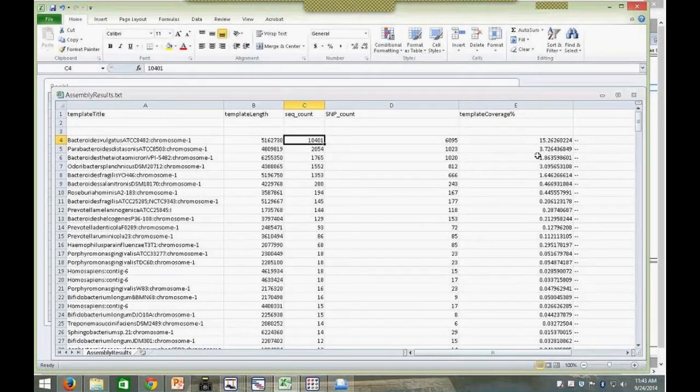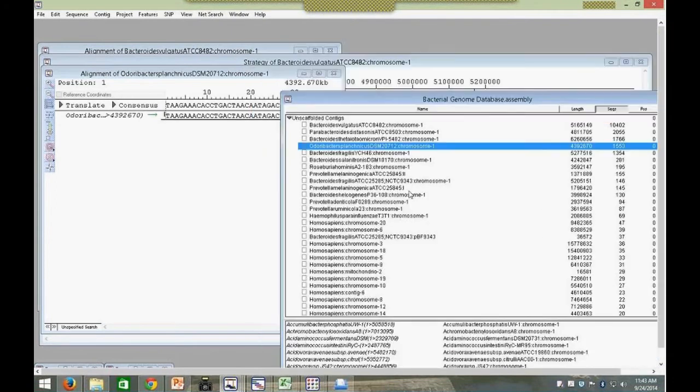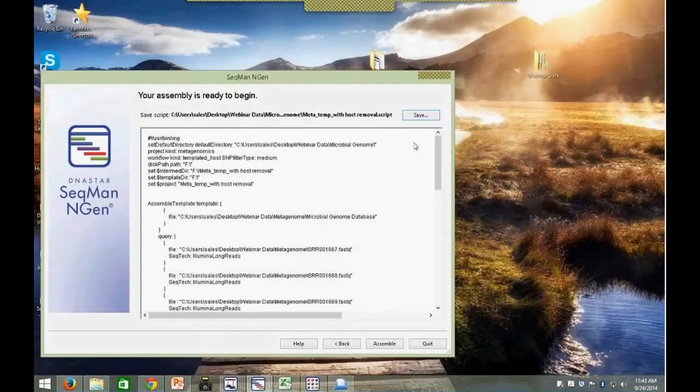And so with metagenomic alignment, depending on where I go from here, I might export contig consensus sequences and do phylogenetic alignments in MegAlign Pro. There's some other things that we can do with this workflow. So it's a great tool. This alignment to this whole bacterial database can be done just in a few hours, as long as you have enough disk space. So it's a really powerful algorithm and gives you a nice output to work with. Okay, so that's our metagenomic workflow.